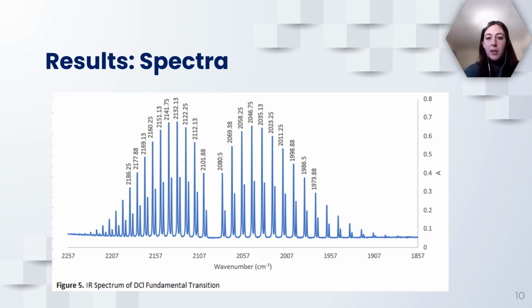You can also see small peaks next to these larger peaks, which can be attributed to the chlorine-37 isotope rather than the chlorine-35 isotope, which gives the larger peaks. This is supported by mass and wave number being inversely proportional, and also due to the relative abundance of these isotopes, the intensity makes sense.